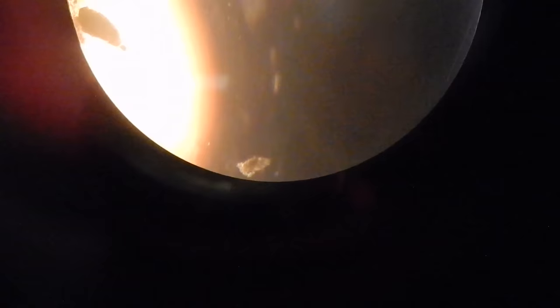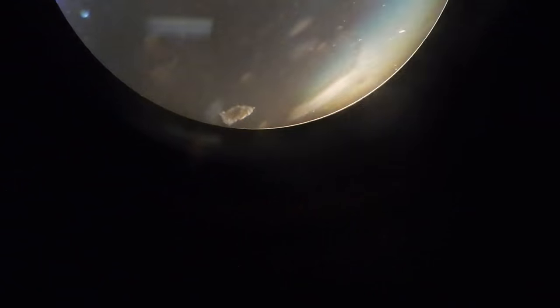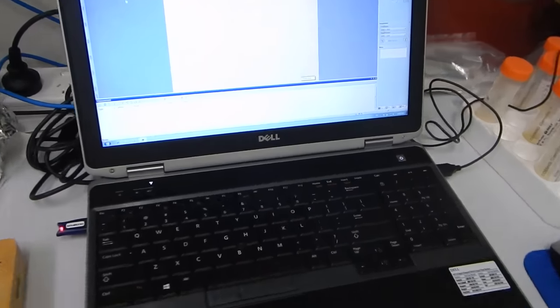Right now I'm doing this with a camera on the lens. This is not the best way to view things—it's a little hard to get the angle right and the lighting. Usually you would just use your own eyes, or you can go to our laptop.